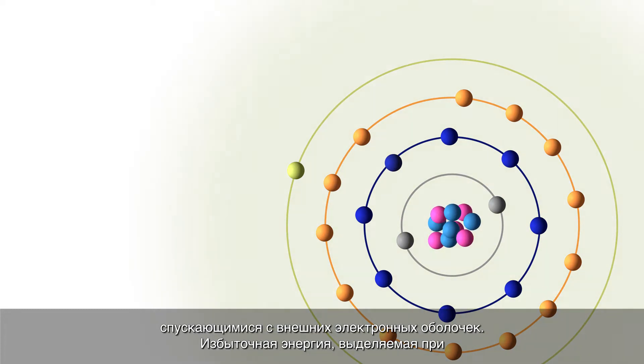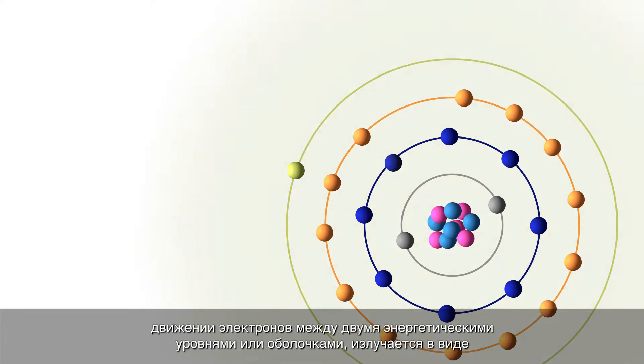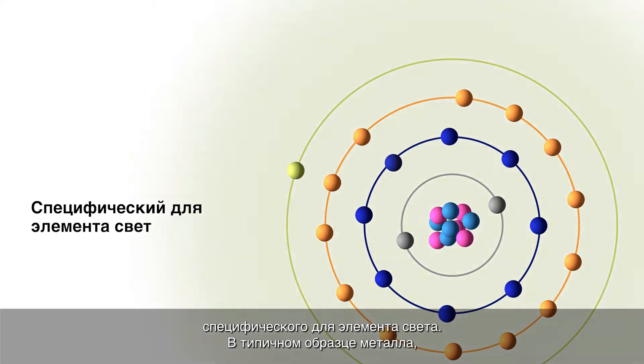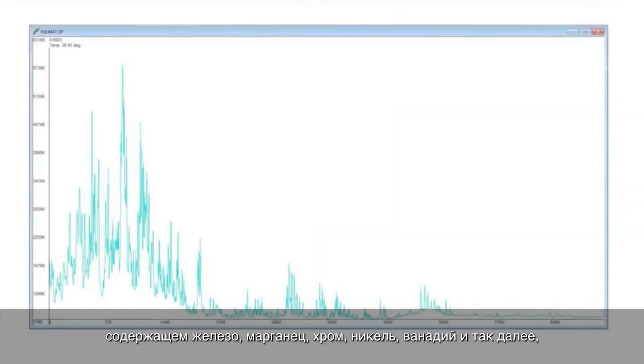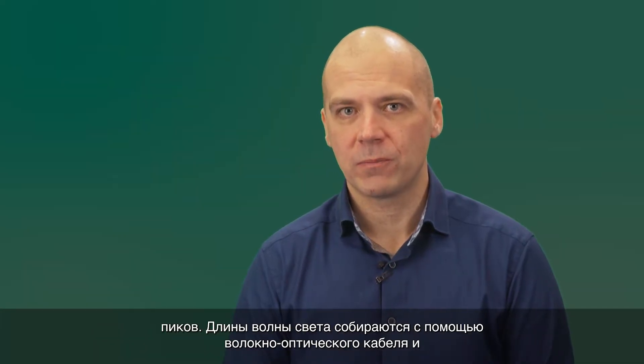The excess energy released when the electrons move between two energy levels, or shells, is emitted in the form of element-specific light. For a typical metallic sample containing iron, manganese, chromium, nickel, vanadium, and so on, each element emits many wavelengths, leading to a spectrum with up to thousands of peaks.